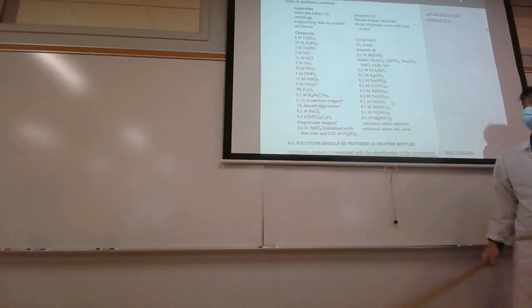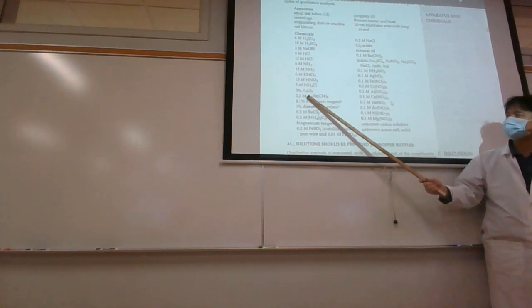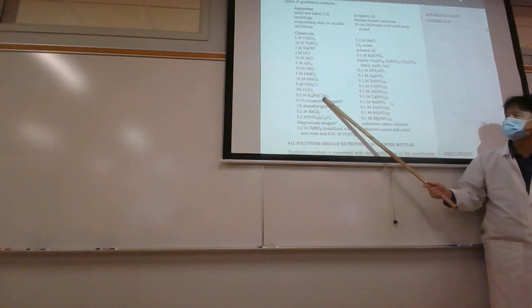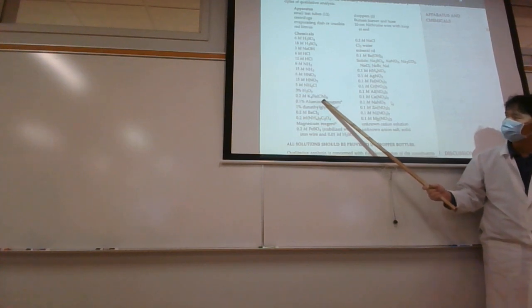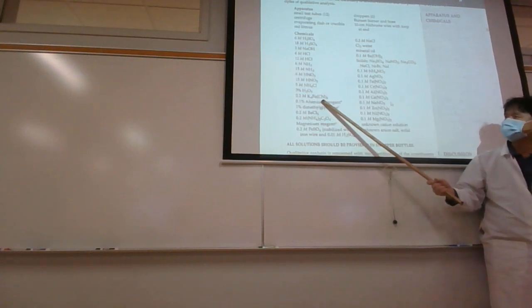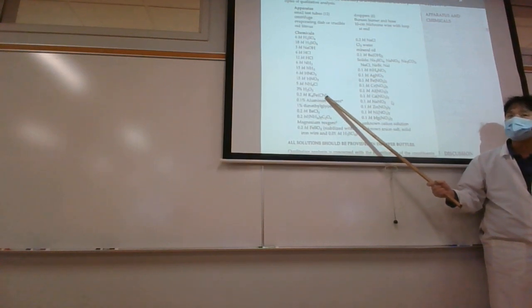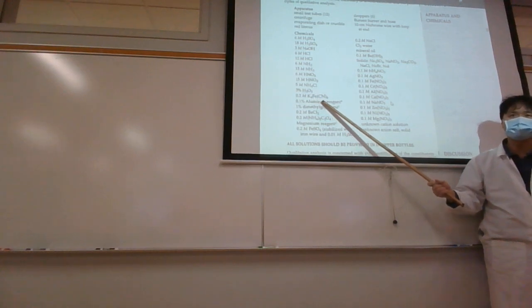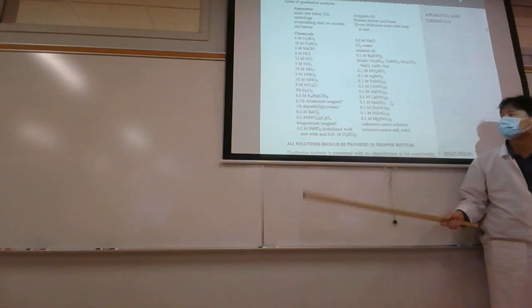And then ammonium chloride's no big deal. 3% hydrogen peroxide is household hydrogen peroxide. This is potassium hexacyanoferrate(II), this is ferrate(II). This is not so hazardous. Use that. Even though it has cyanide in it, the cyanide ligands are strongly bound to iron, and so it's not like free cyanide. If this were potassium cyanide, then it'd be pretty hazardous.